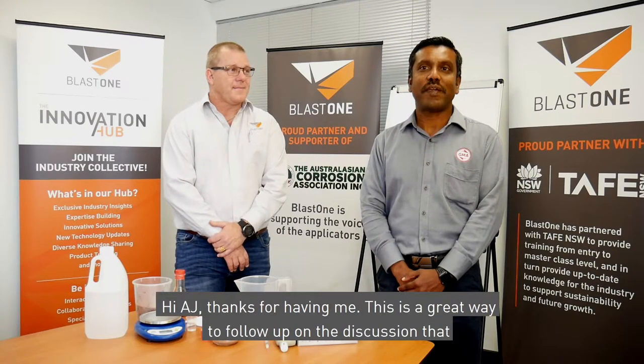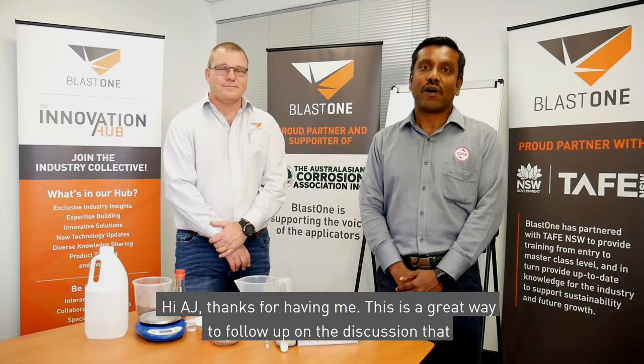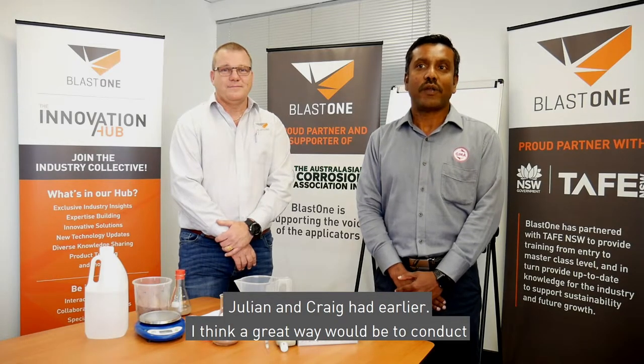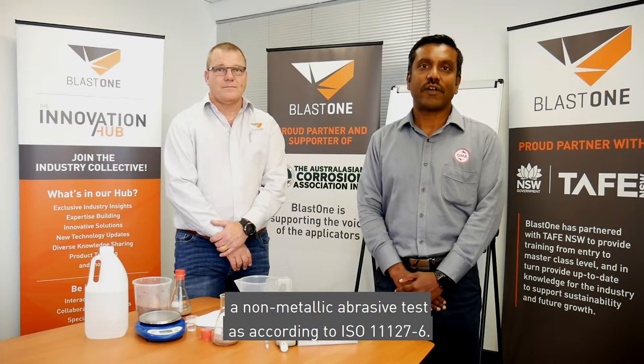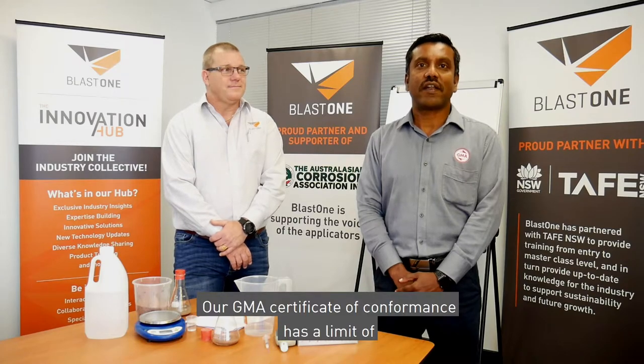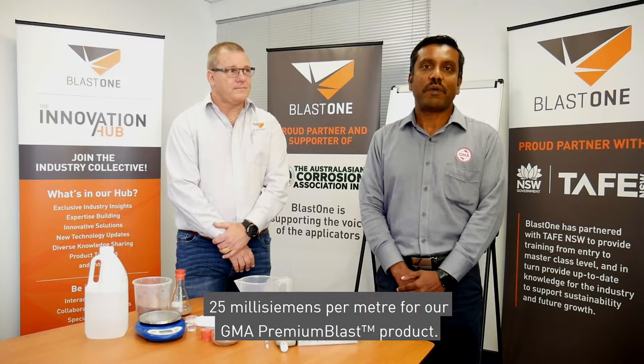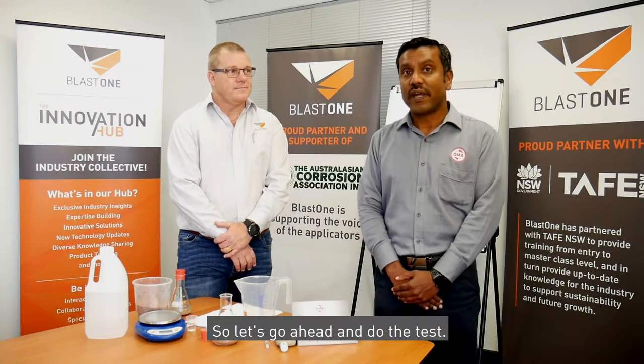Hi AJ, thanks for having me. This is a great way to follow up on the discussion that Julian and Craig had earlier. I think a great way would be to conduct a non-metallic abrasive test as according to ISO 11127-6. Our GMA certificate of conformance has a limit of 25 millisiemens per meter for our GMA Premium Plus product. So let's go ahead and do the test.